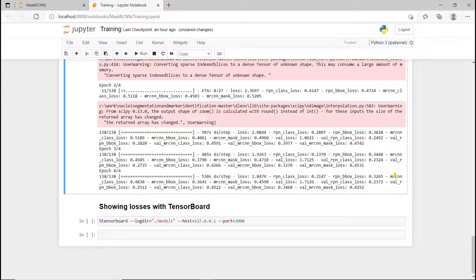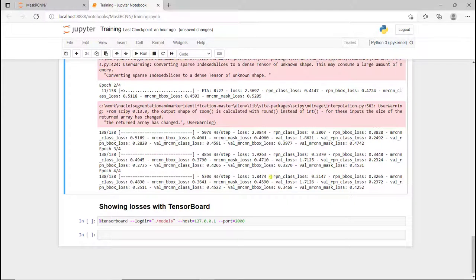For Mask R-CNN, there are 3 losses: the class loss for Mask R-CNN, the bounding box for Mask R-CNN, and the segmentation mask. If you add all these losses, you actually get the loss here.